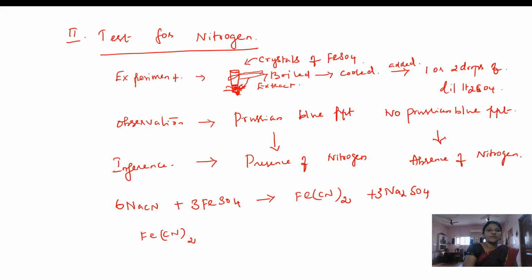Then it is the test for nitrogen. The test for nitrogen involves the experimental part, observation and inference.